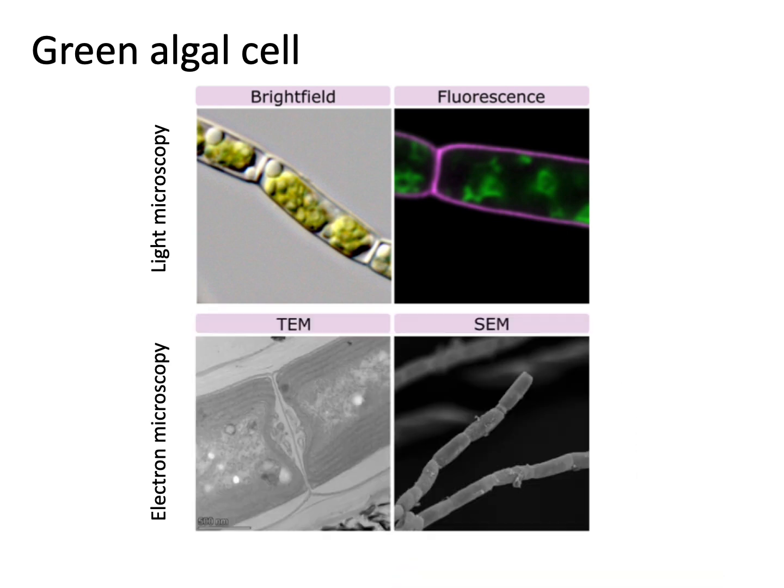Now with electron microscopy, which we'll look at coming up, again, there's some electron microscopy that behaves like bright field where light passes through it, and those sections need to be thin. And these are all on the same type of single cellular algae. And this also highlights that it's not necessarily always about magnification, although electron microscopy for sure can magnify more. That's not always the point.